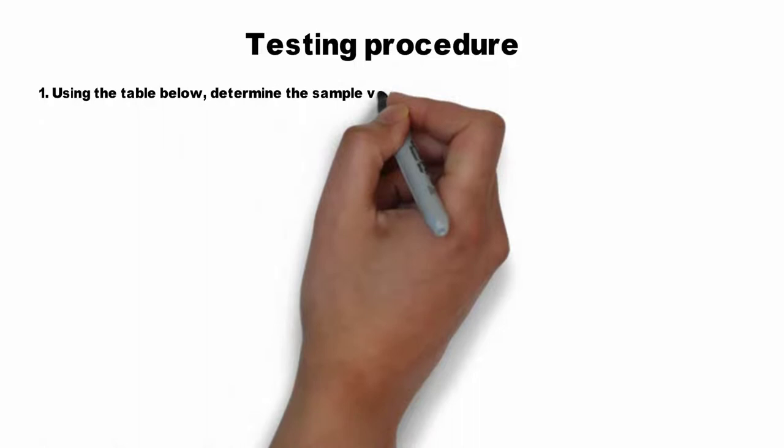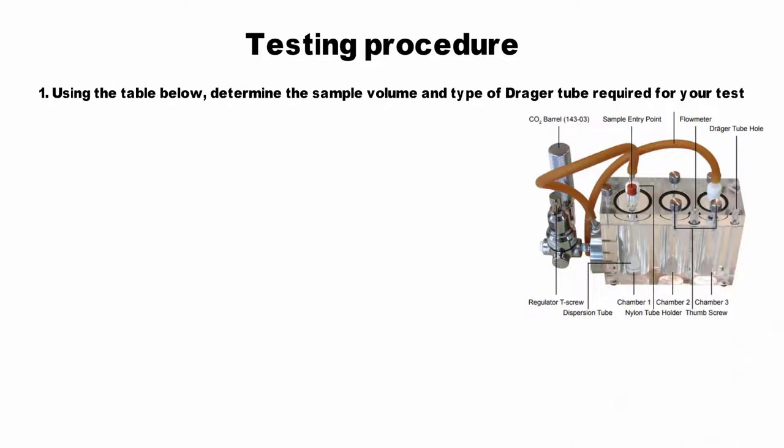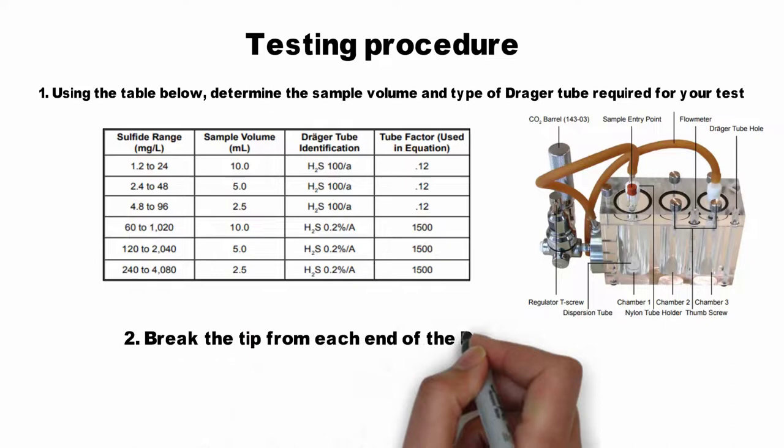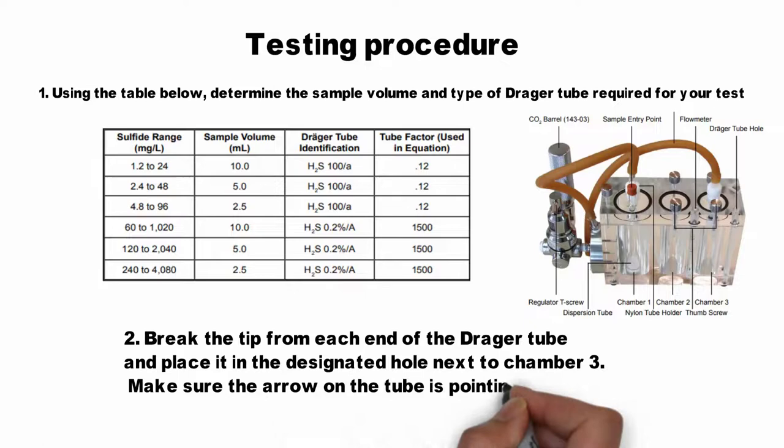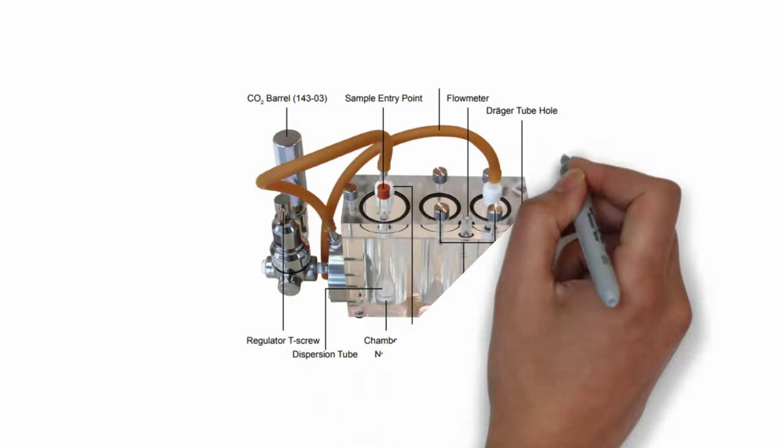For the testing procedure, using the table below you can determine the sample volume and the type of Draeger tubes required for your test. Break the tip from each end of the Draeger tubes and place them in the designated hole next to chamber 3, making sure the arrow on the tube is pointing downward and that the O-ring seals around the tube. Next, connect the rubber hose from chamber 3 to the Draeger tube.